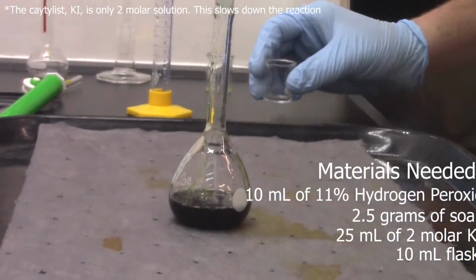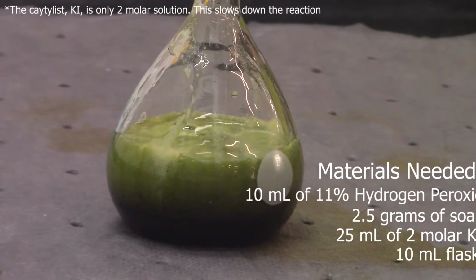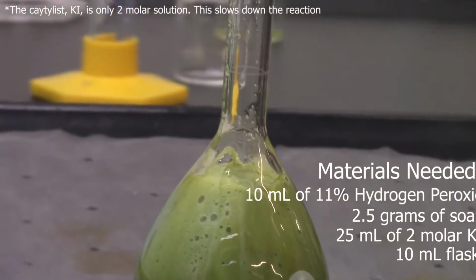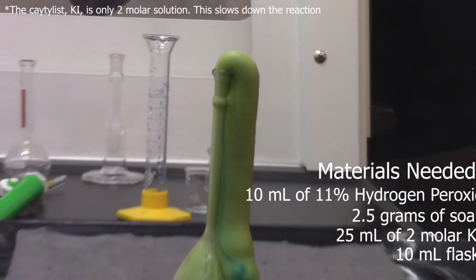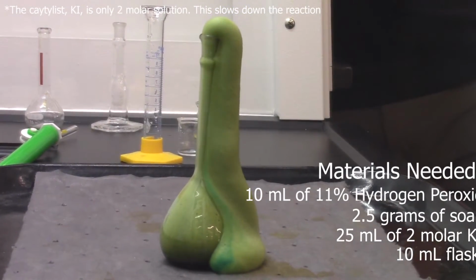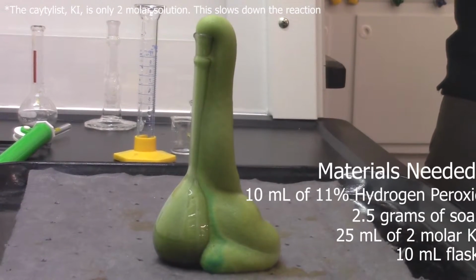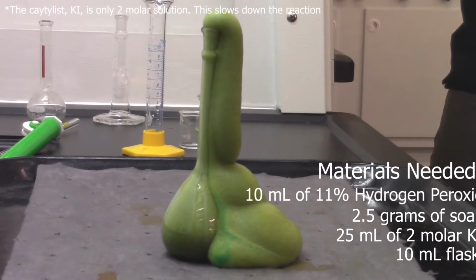Adding 3, 2, 1. Anything? Oh, something? Start going fast. And there's the blue. Why did we make green? That was purple. No, we added... Well, there's a lot of yellow in the reaction. Yeah, there's like an orange, and we added red and blue.